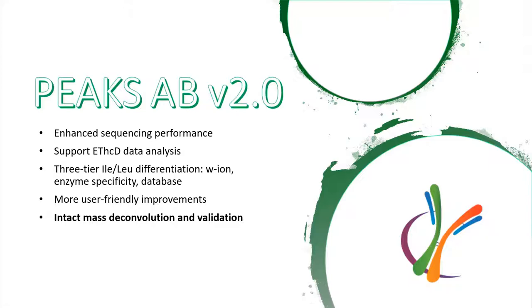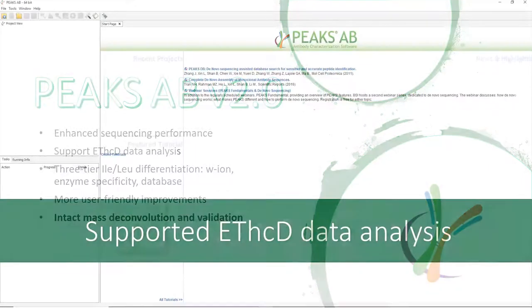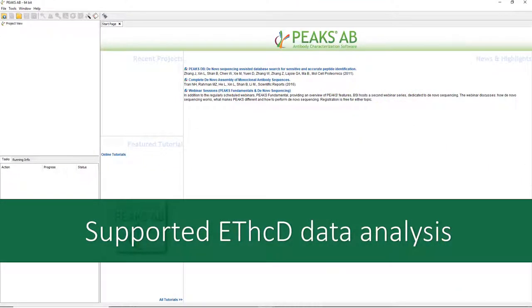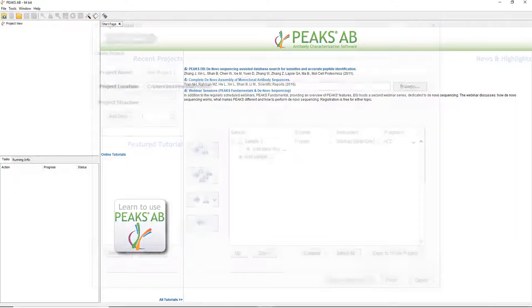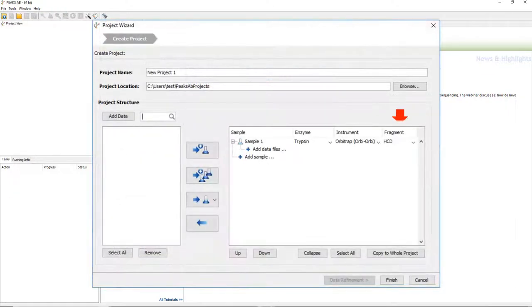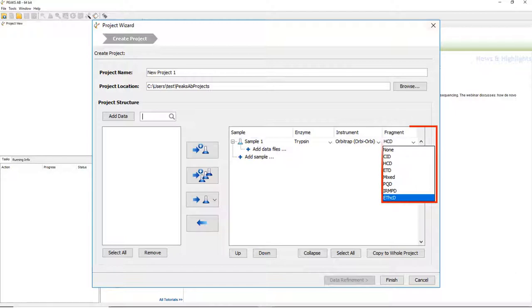Now let me show you some details. First, if your data is generated by ETHCD fragmentation method on Thermo Orbitrap Fusion mass spectrometers, now in PICS-AB 2.0 you can analyze such a dataset. When you create a PICS-AB project, simply choose ETHCD in the fragment method list.